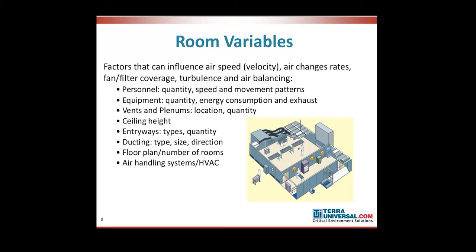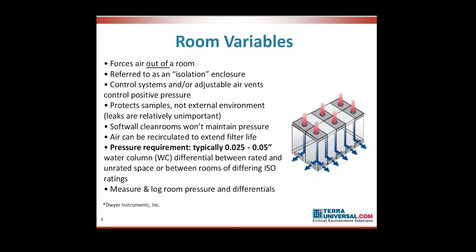So how does this shake out in terms of specific USP room considerations? Well, in the typical USP 797 sterile compounding room, we are looking at a positive pressure system. We are trying to maintain typically ISO 7 or a little bit better. So we'll have our ceiling filter fans that are directing the airflow downward. Air is exiting the room near the floor, along the perimeter of the room, as you see in the illustration.